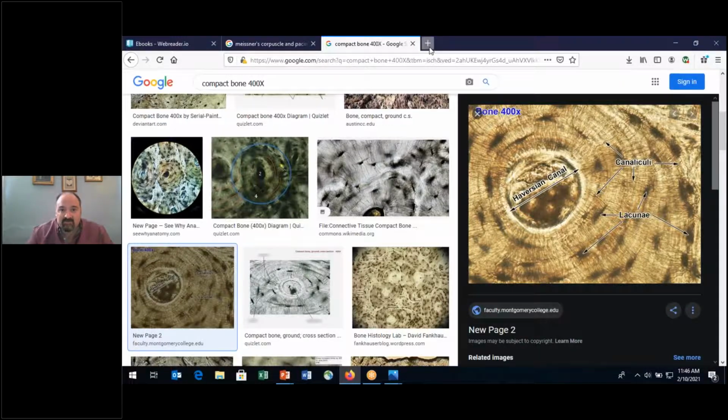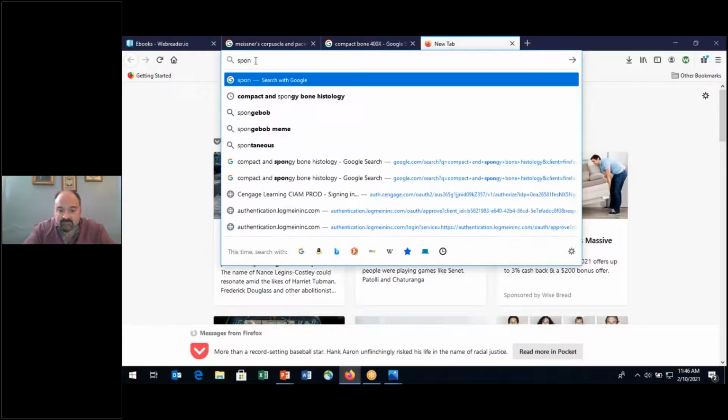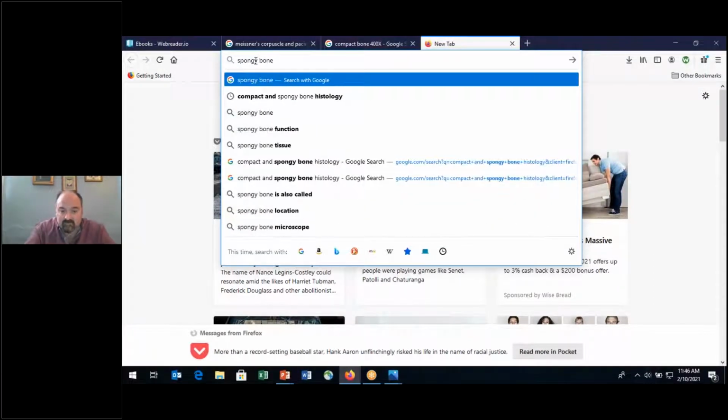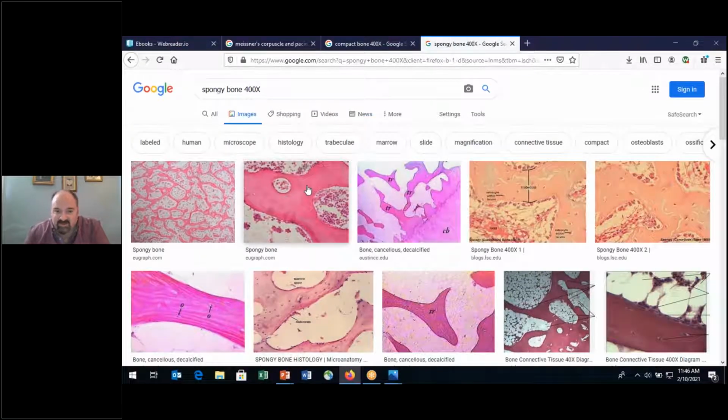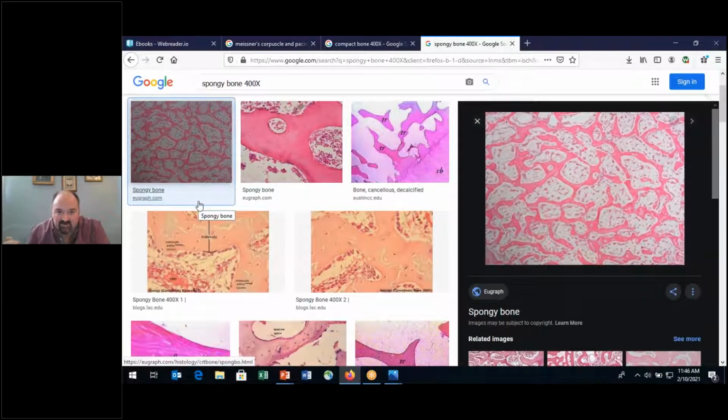Now the spongy bone, here. Okay, so what we're looking at here, I'm going to take a view that's a little bit like at 100 magnification. And what you're seeing here is that these pink, see the pink lines? These are the trabeculae, the rods of bone, okay? The rods of bone, that's the spongy bone. Anything in between, in those spaces there, would be marrow and vasculature, okay? Marrow and vasculature present in these spaces, but the thick pink, that's the spongy bone.